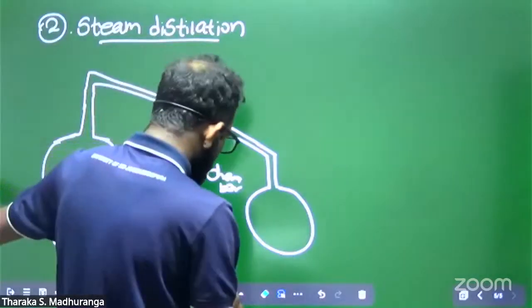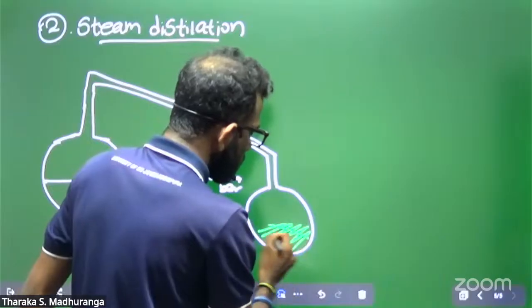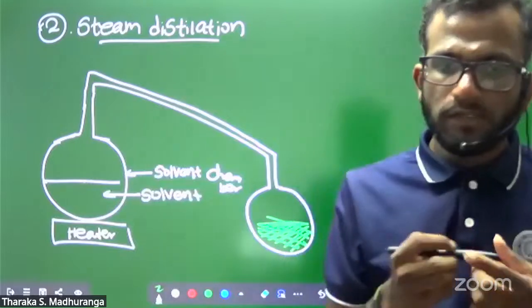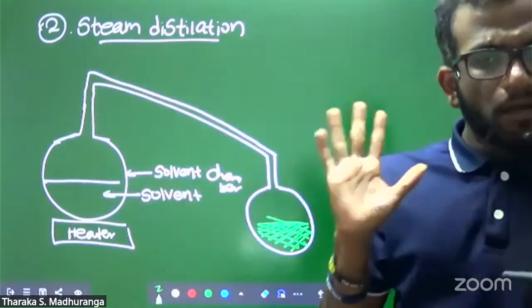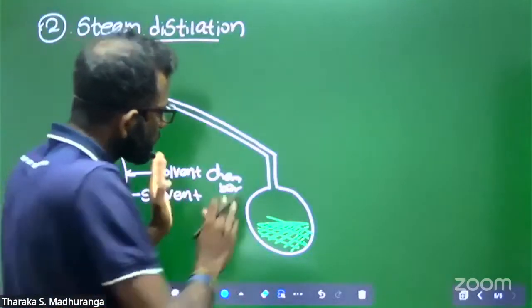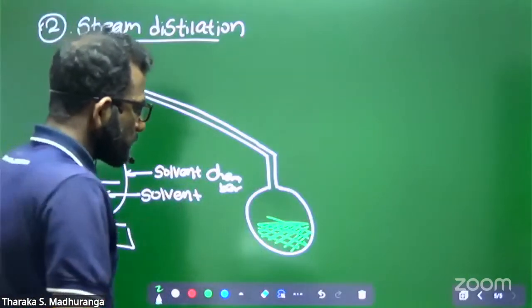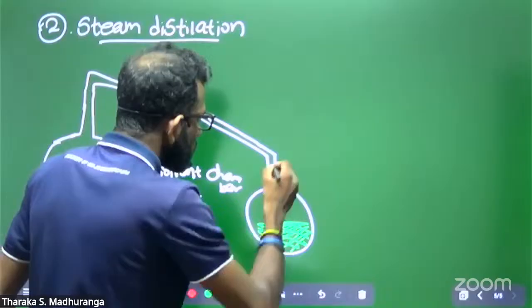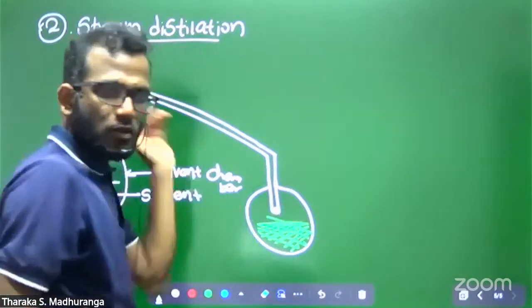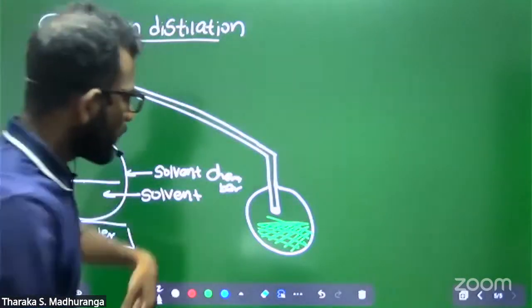Okay, they are the plant material. In this plant material, same, we need to cut into small pieces to increase the surface area. They are common for all methods. Now that's the plant material. Now we need to add this line, the solvent vapor carrying line, transferring line.